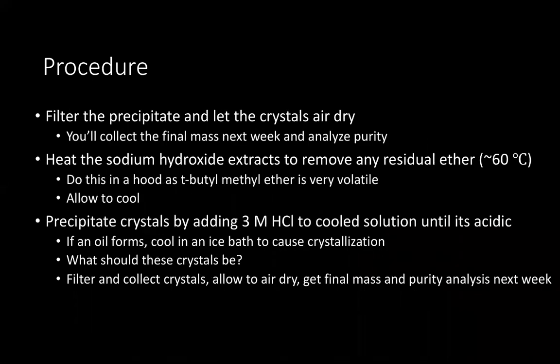Once you've made the precipitate, you need to isolate it by filtering using a vacuum filtration process and letting your crystals air dry — this will take over the next week. We'll collect the final mass and analyze purity next week, so your data won't be due for at least a week. Your lab book doesn't give much procedure for filtration because we've already done the recrystallization lab — you're expected to know how to do that. If you're not completely clear, look at the videos from the recrystallization lab.